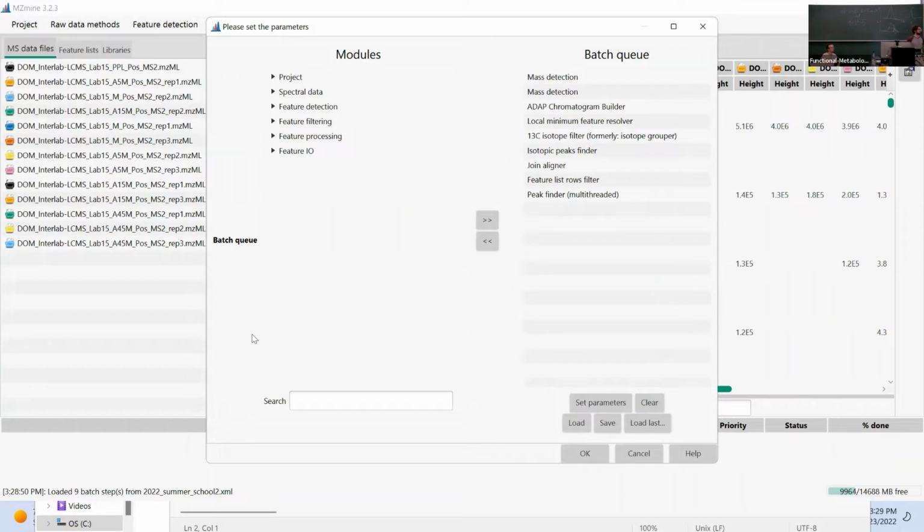Maybe to add a couple of parts to that, because I think this is a really critical moment for us to proceed with all the other tools downstream. So that feature finding, I know it's complicated, but it's also very central, because if you mess this up here, then everything downstream might not go as expected. So for the sake of the learning experience of the other modules, it's important that we get good results out of it. Robin and Steffen walked you through each single step, and I hope you now understand what's happening under the hood.